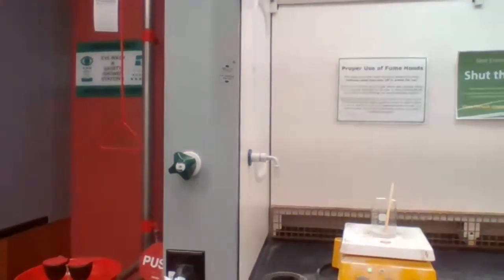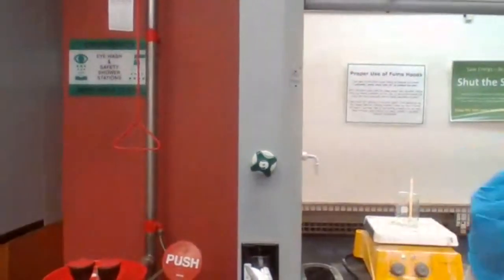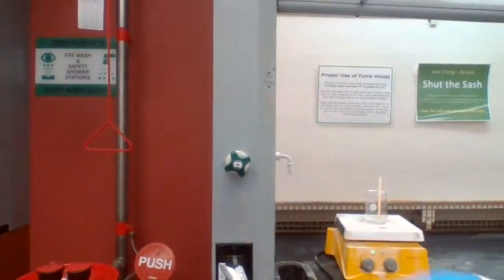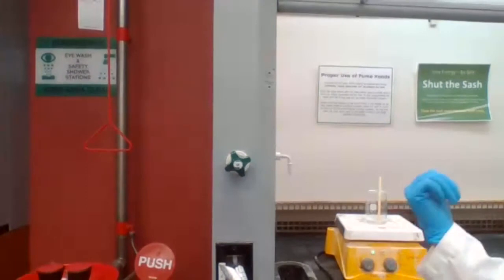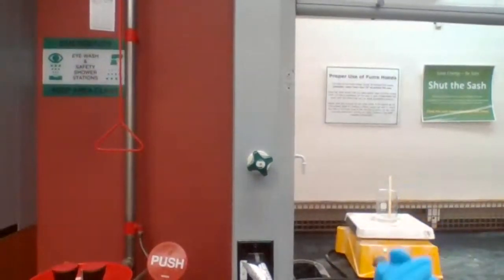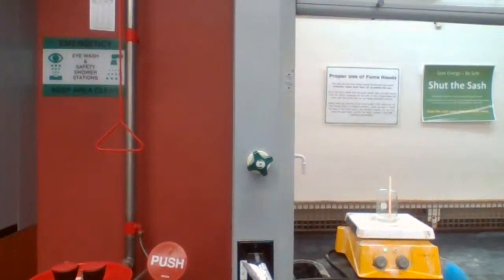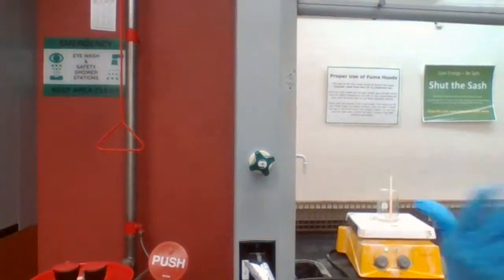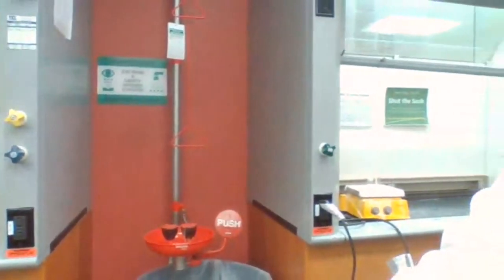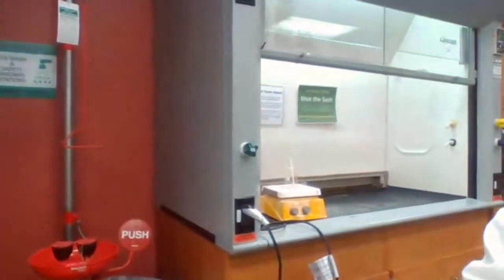So we use an anhydrous agent to dry the solvent. Drying solvent is just removing water from the solvent. And now we are heating up to evaporate the solvent because we have a solution. Our solution is made of ether as solvent and our ester as the solute. We don't need the solvent. We only need the solute. So we have to heat it up in order to get the pure sample.